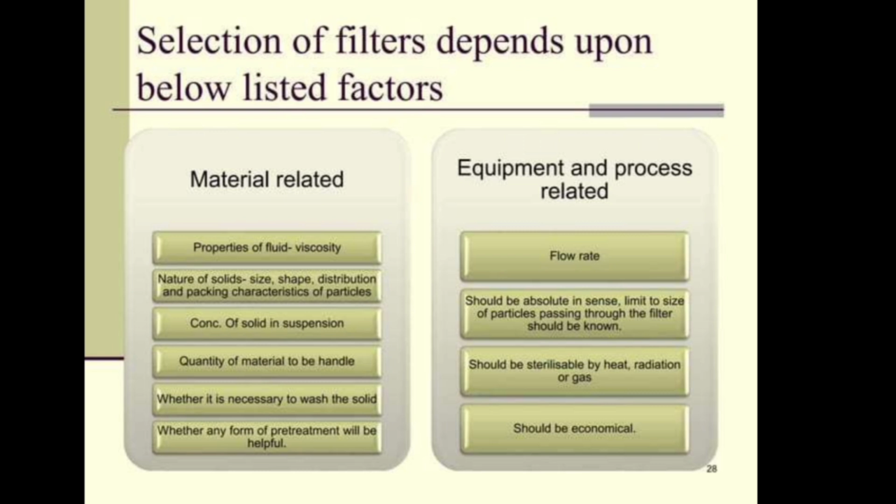First, the material related properties of the fluid: viscosity, nature of the solid, size, shape, distribution and packing characteristic of particles, concentration of solid in suspension, quantity of the material to be handled, whether it is necessary to wash the solid, whether any form of pretreatment will be helpful.